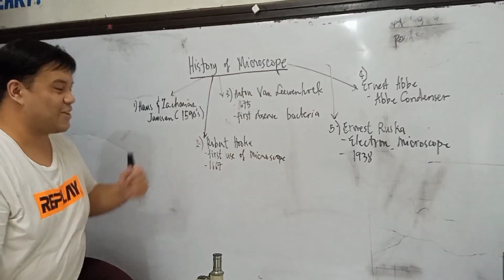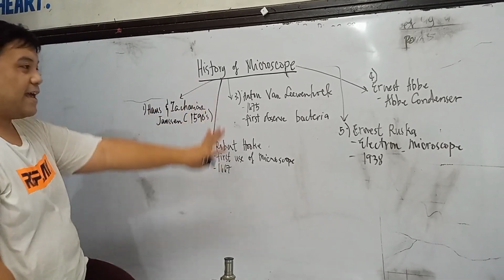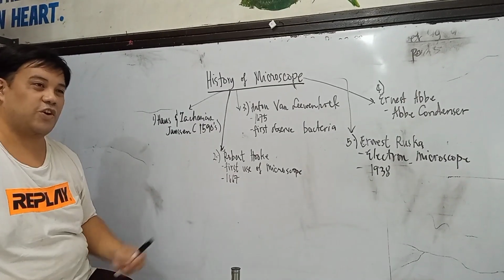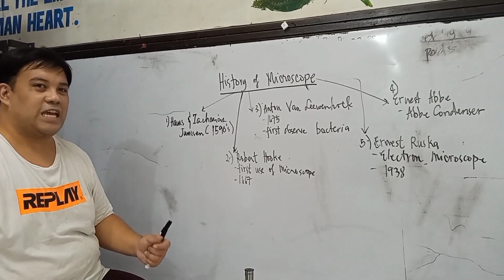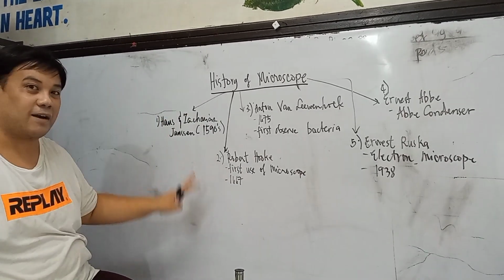So, let's get started. I have here 5 scientists who invented, discovered, and started their journey in the microscope history or background.